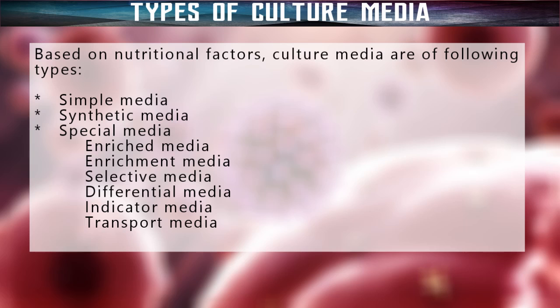The next is indicator media. An indicator is included in the medium. A particular organism causes a change in the indicator. Examples of this indicator media are blood agar and MacConkey agar.